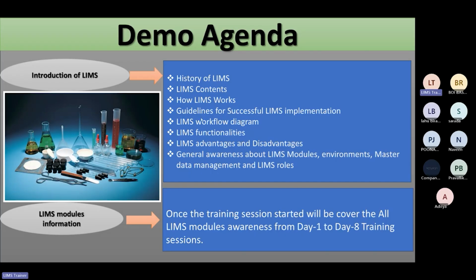Then the LIMS workflow, how the workflow actually happens in the software, I will also explain. Then the different functionalities available with the software, and some advantages and disadvantages related to the software.